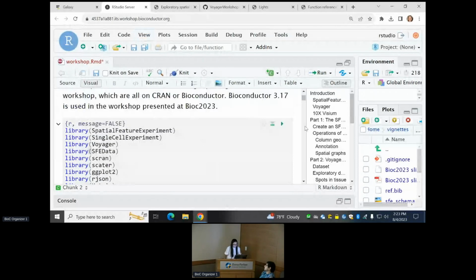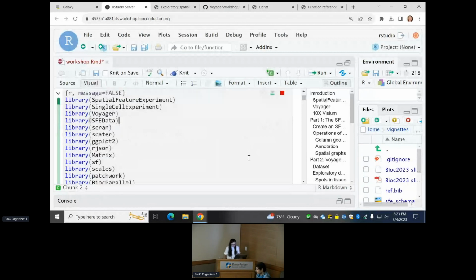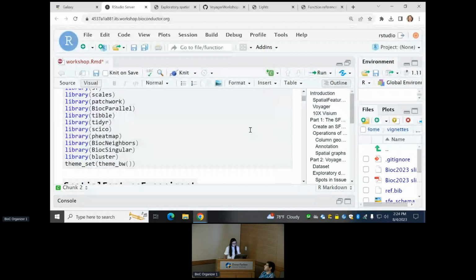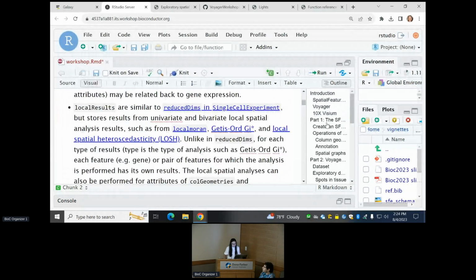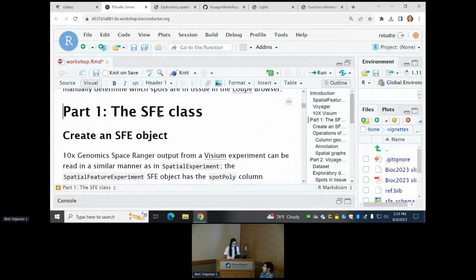Yeah, so first here we load the packages. That's already covered, so I'll just jump straight to part one.